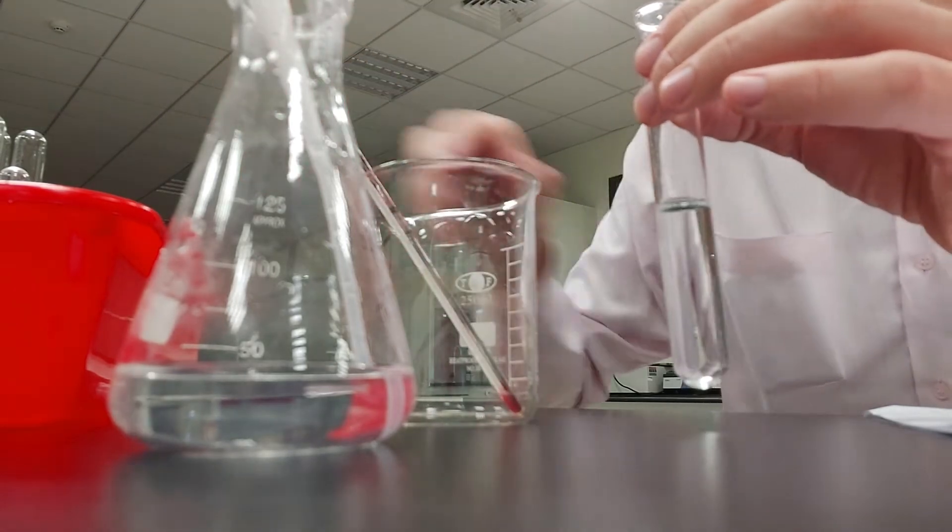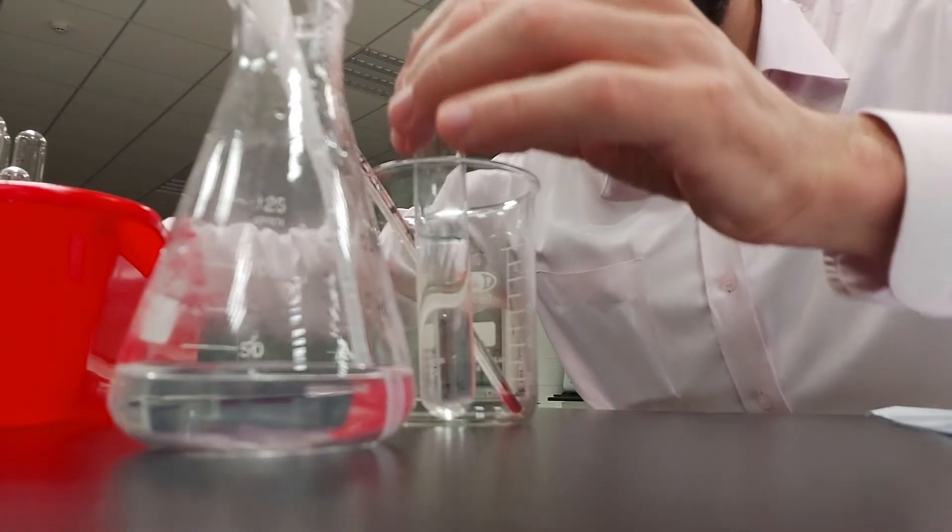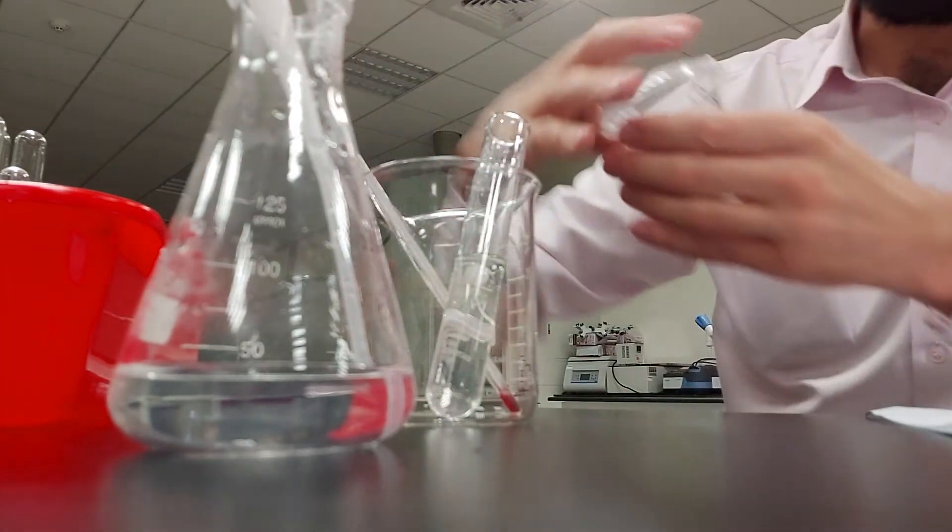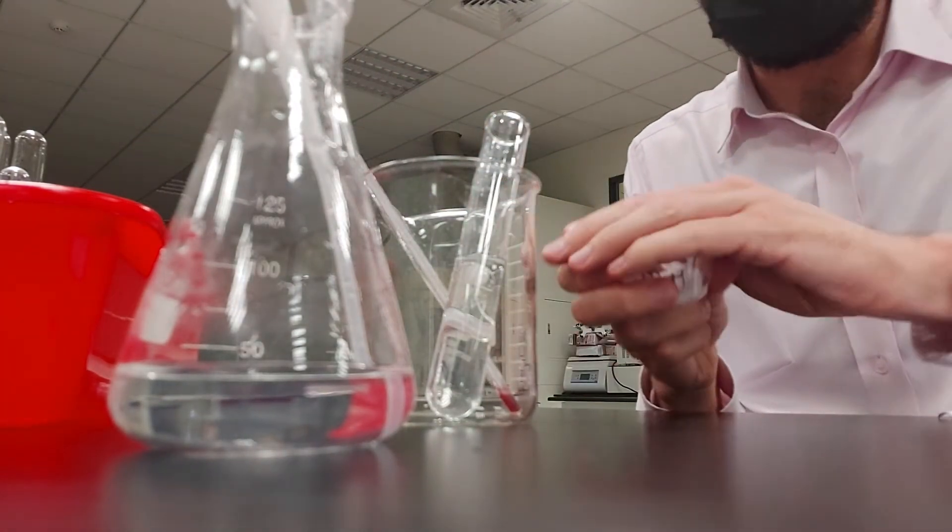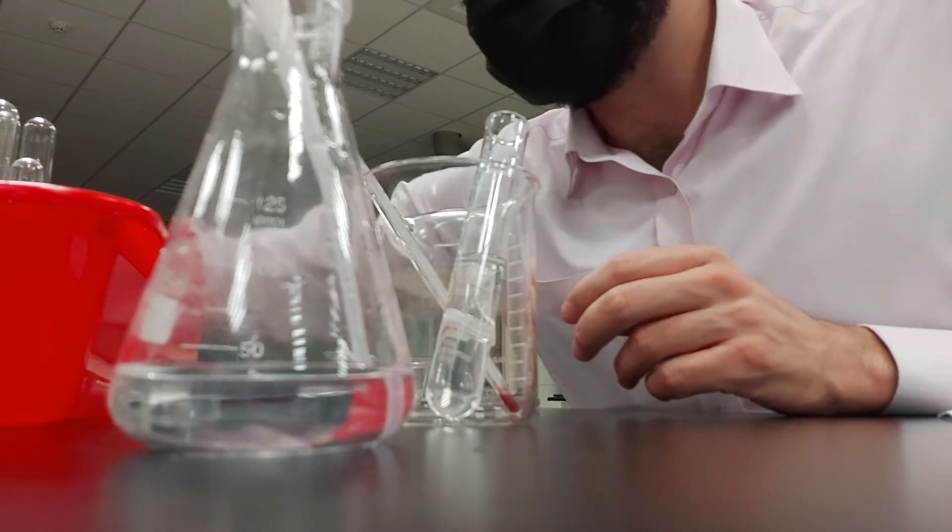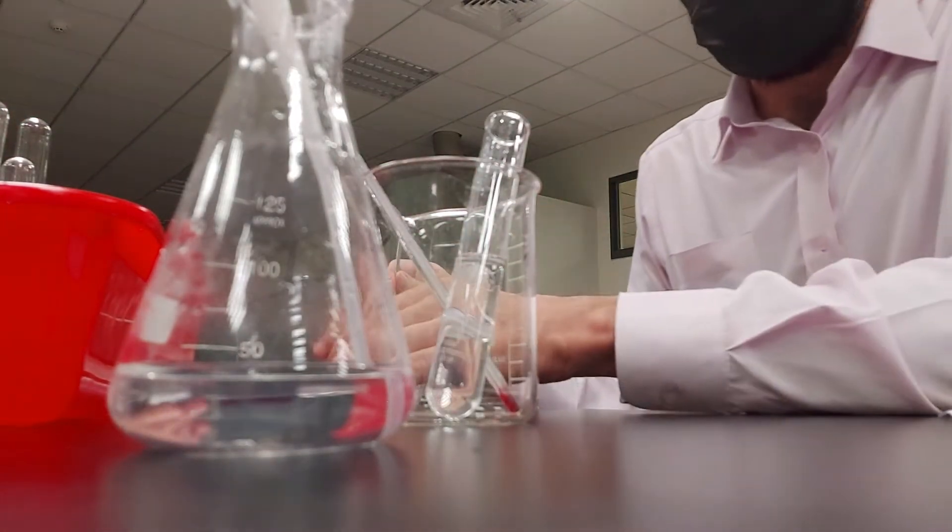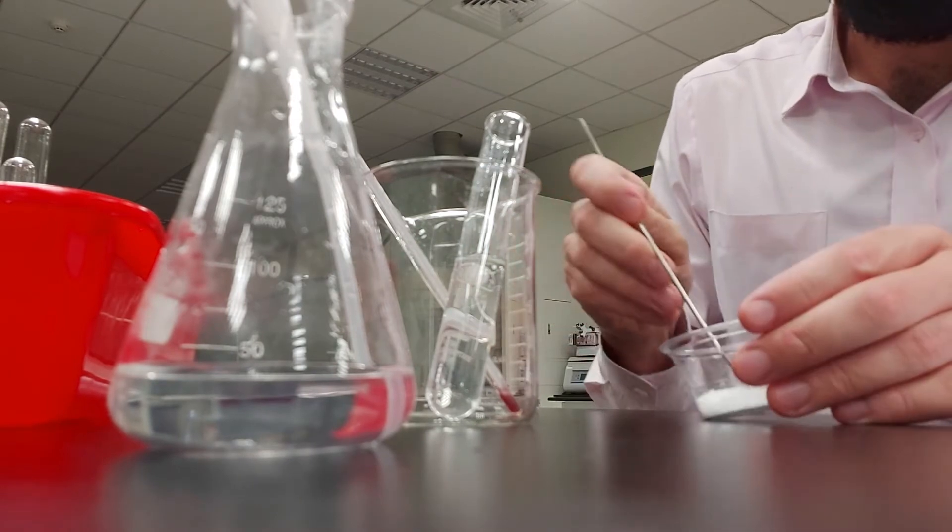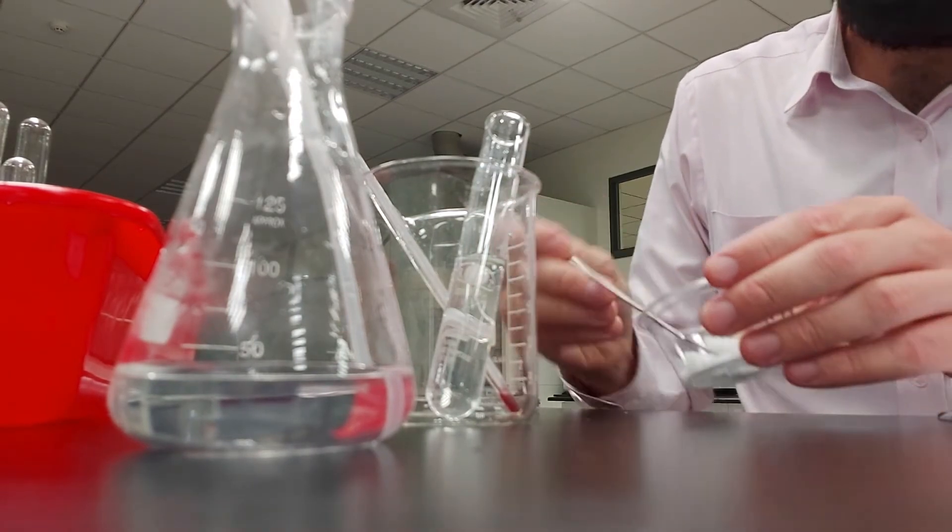So we'll put this thermometer there for a second. And so I'm going to add this. This is magnesium sulfate. I'm going to add some of this to the acid and we'll see what happens to the temperature once it's been added.